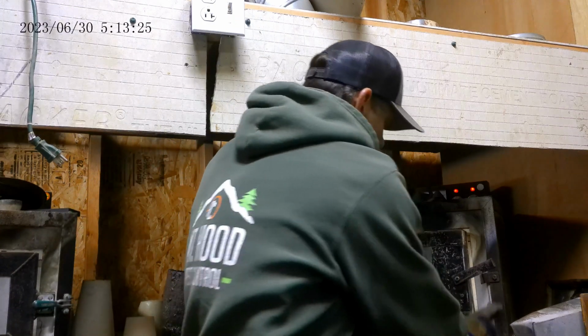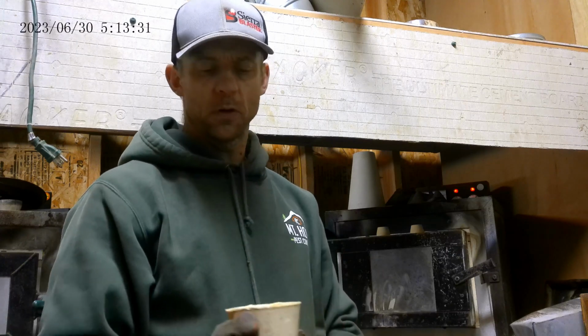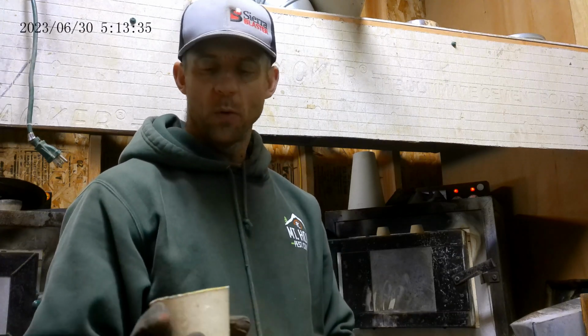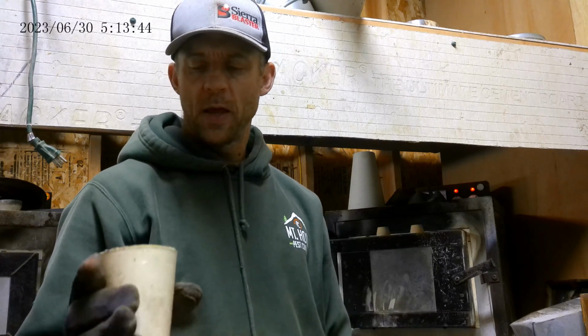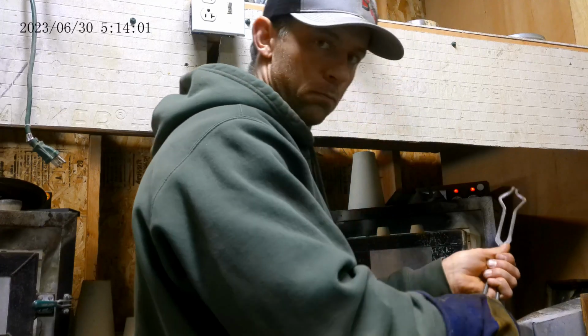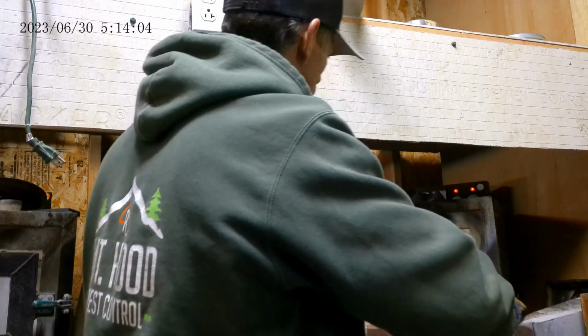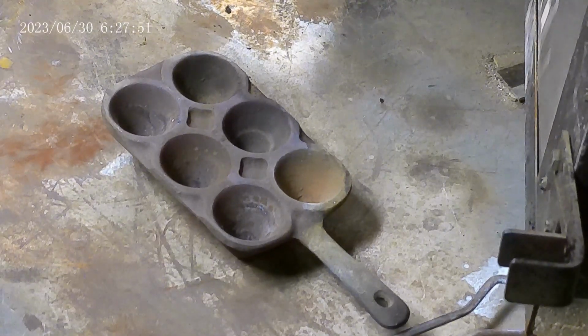Okay, so I got it mixed up here in the crucible. I had 25 grams of concentrates after all that pre-treatment. I went with a 4-to-1 flux ratio. I use a litharge-based flux that I made. So 100 grams of flux, and I went 3.5 grams of flour to reduce, hoping for around 25 to 30 grams of lead. And we'll stick it in the furnace, see what we get. All right, let's get this baby poured.